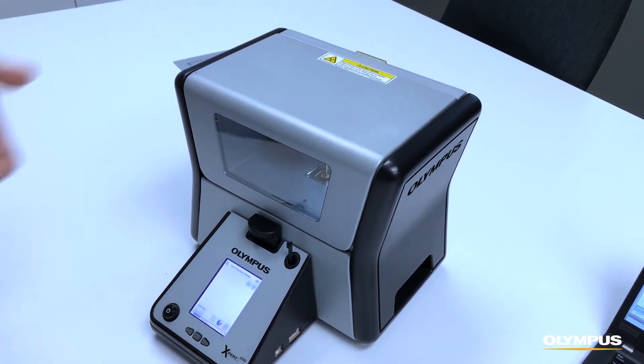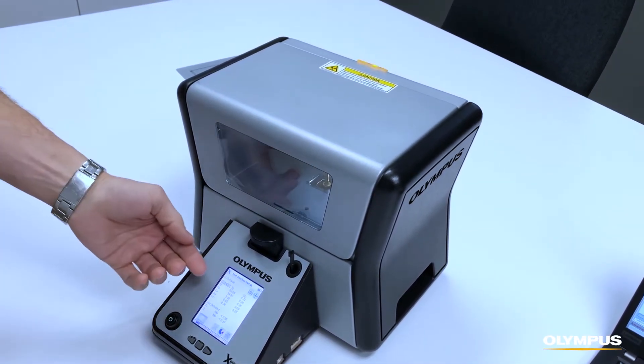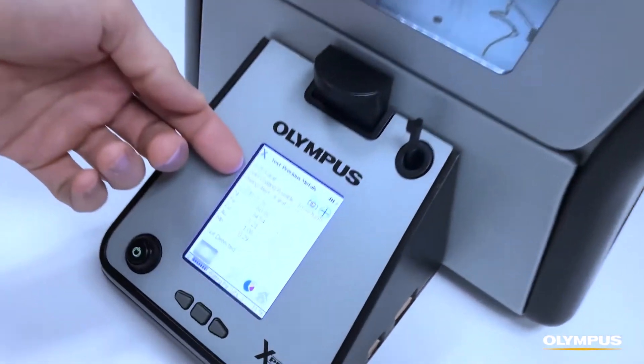The software even has an innovative plate alert feature, so that if you're dealing with gold-plated materials, it'll give you a warning on the screen that this might be plated and that you should investigate this sample further.